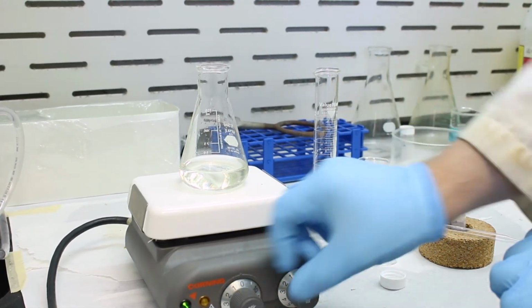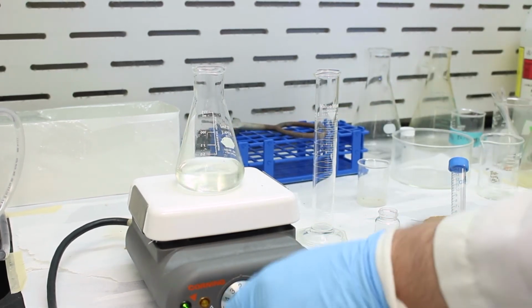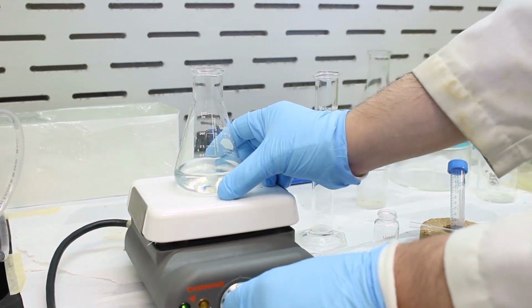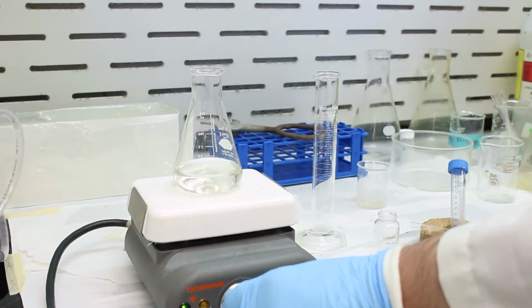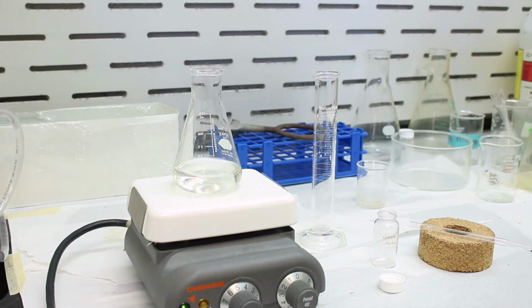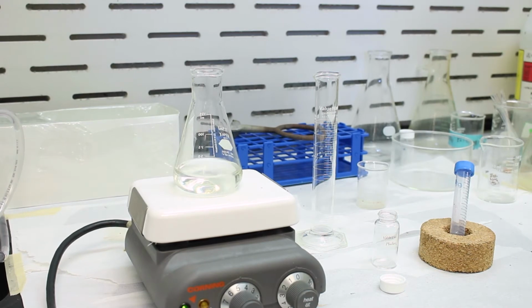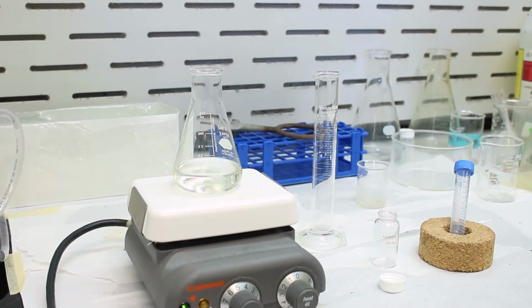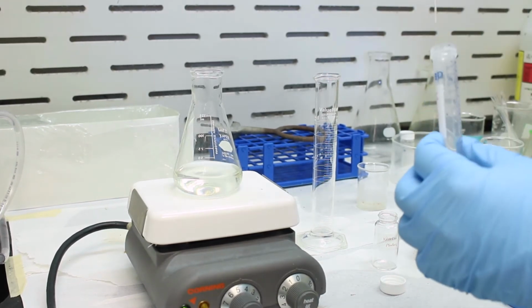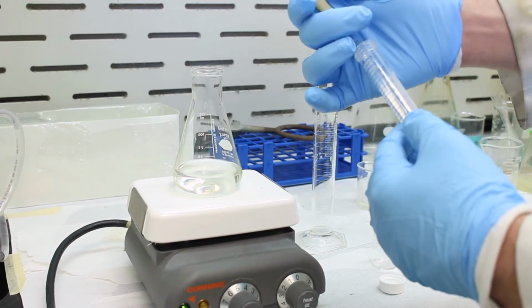Okay, so we'll give it a brief stir here. Make sure it's dissolved. And interestingly, as we know, acetone is both a solvent and a reactant in this reaction. So it's a solvolysis reaction. It will participate in this reaction. So to get the aldol to start between the acetone and the anisaldehyde, we're going to add our catalyst, which is sodium hydroxide. This is 1.8 grams dissolved in 3 mL of water.